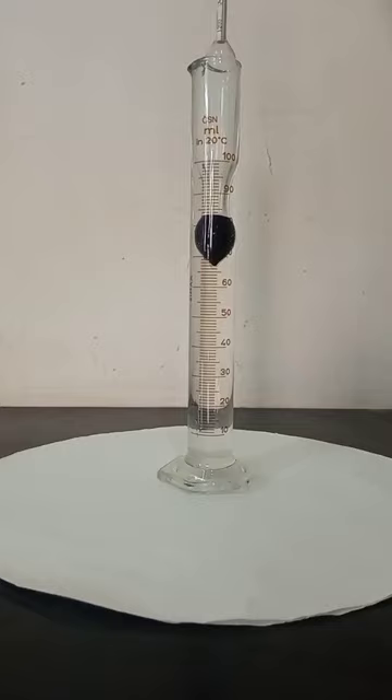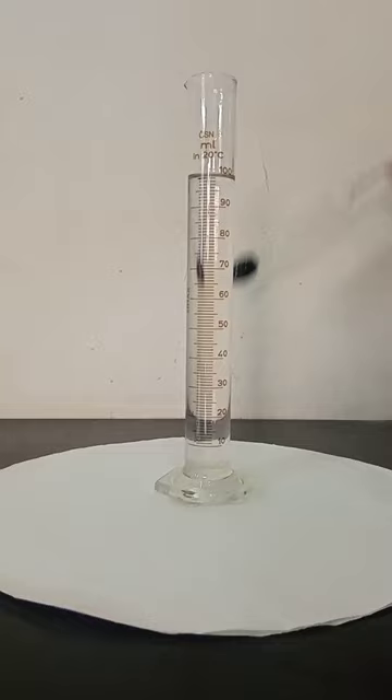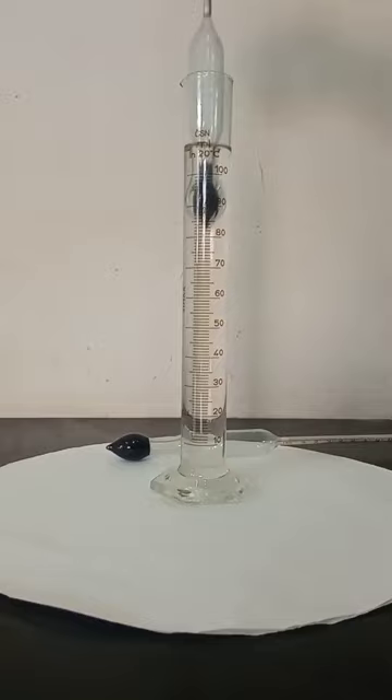A hydrometer is a thin glass or plastic tube sealed at both ends with a graduated or printed scale calibrated to a specific gravity. One end of the tube is bulb-shaped and weighted with a ballast of either fine lead shot or steel shot.